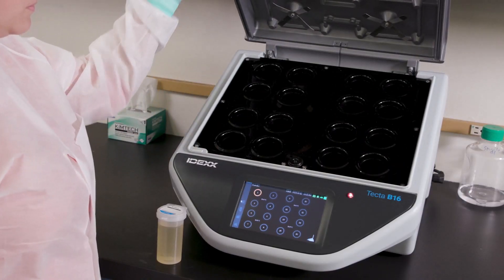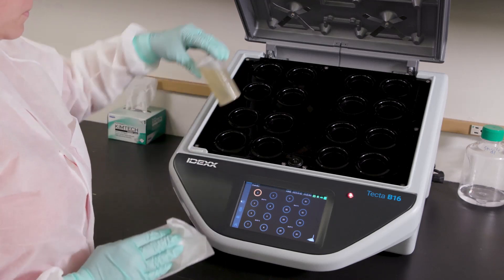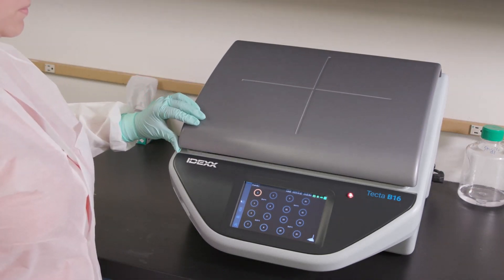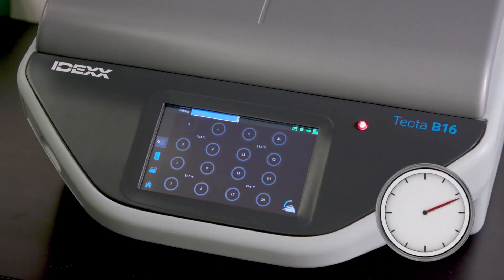Open the lid, ensure that all cartridges are dry, and add your sample to the corresponding chamber. Once the TECTA alert cartridge has been added, close the lid. A progress bar will appear on the display as the TECTA instrument detects the cartridges that have been added.